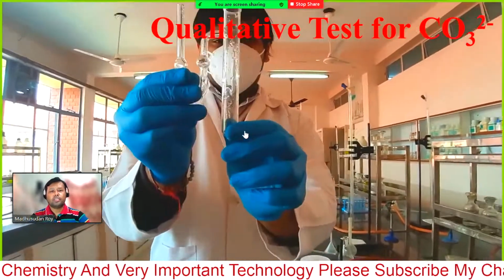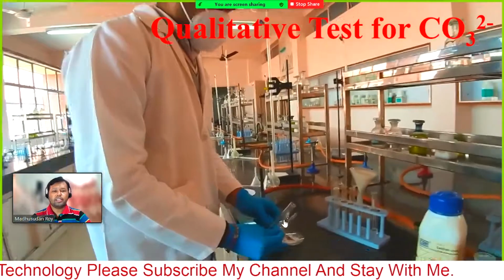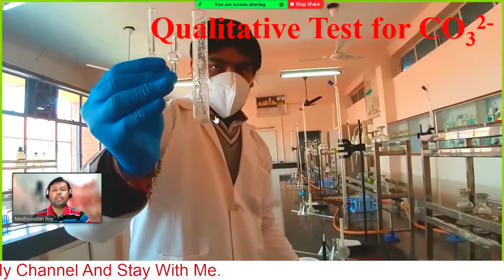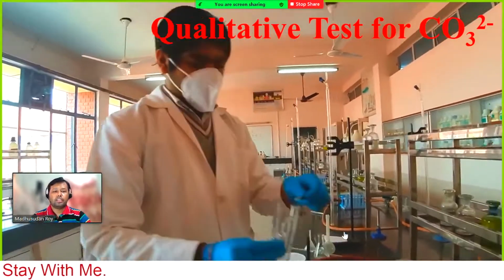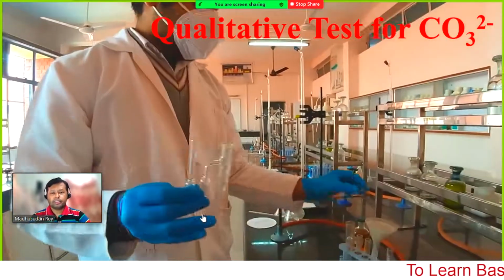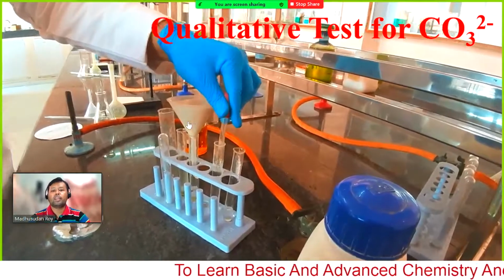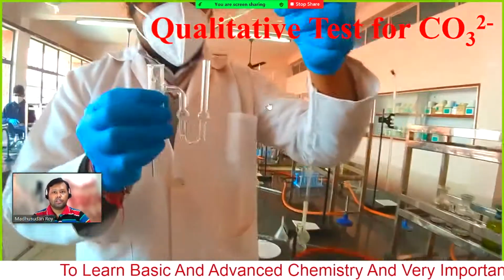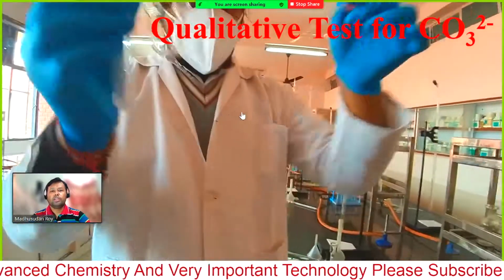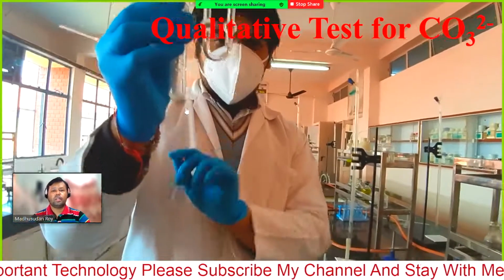So this is the instrument they are going to use, and you have to take the sample in the left side, that means in the test tube. He's taking a little bit more sample. Okay, then add lime water, freshly prepared lime water. Here they have filtered the lime water to get the clear solution. Here they are taking the lime water in the small tube. Now we can see this is the clear solution of lime water, and here is the salt.